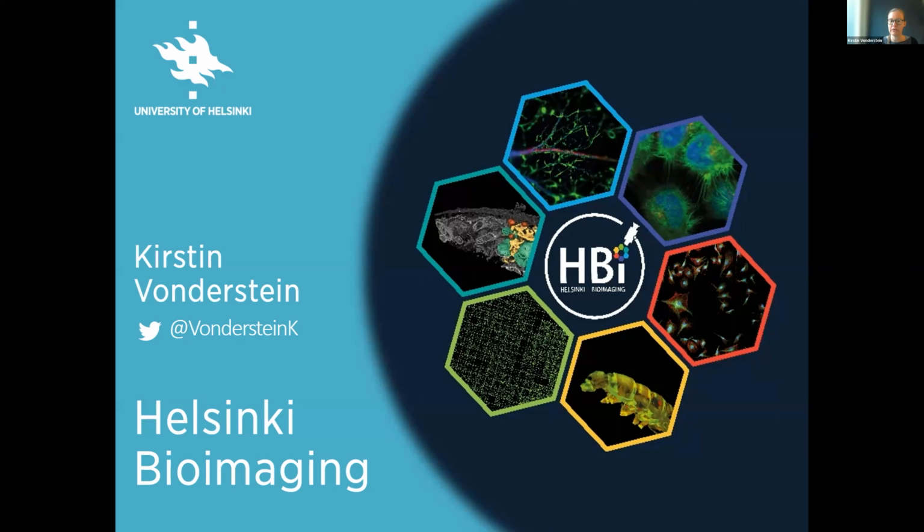And we are part of the Helsinki Bioimaging platform together with another light microscopy core facility on the other campus, an electron microscopy facility, and a high content imaging facility. So together we can offer our users quite a broad range of techniques, starting from the basics like confocal and wide field spinning disk, but then also super resolution, light sheet, and then the high content and the electron microscopy. And we are also part of the Finnish Euro-BioImaging node.